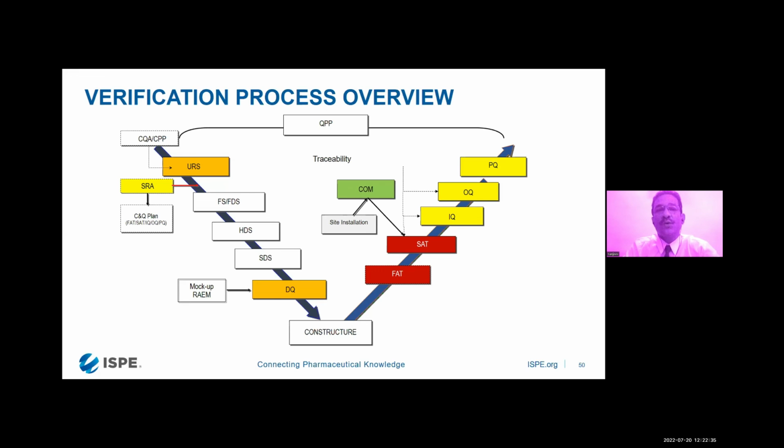You are also going to carry out certain operational qualification tests at the supplier end, which we call critical tests. So if in operational qualification you have more than 20-30 tests, you will be conducting some of the tests which are very critical with respect to the operation or working of this particular isolator.